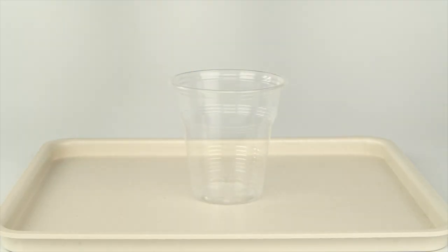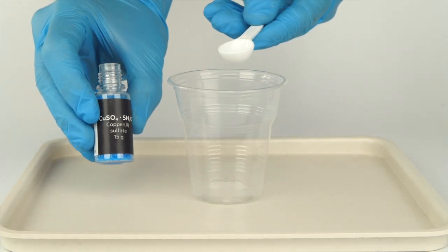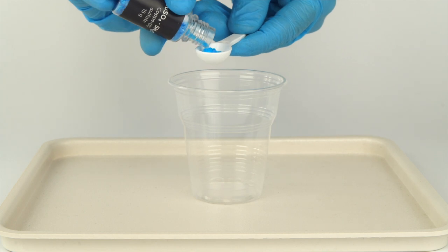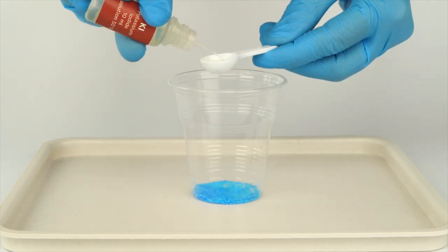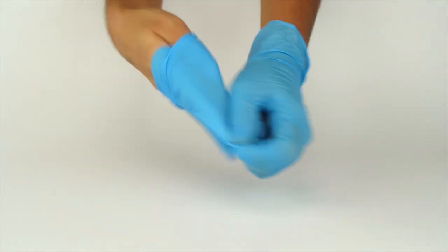Pour one big spoon of copper sulfate from the bottle with a black sticker into the plastic cup. Add one big spoon of potassium iodide solution. Take off your protective gloves.